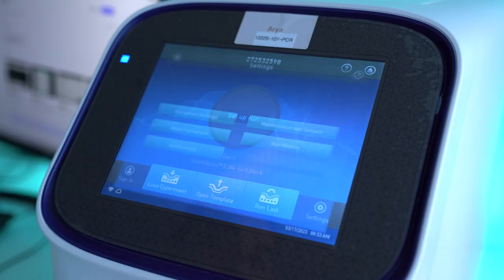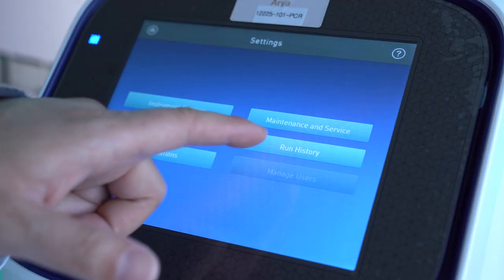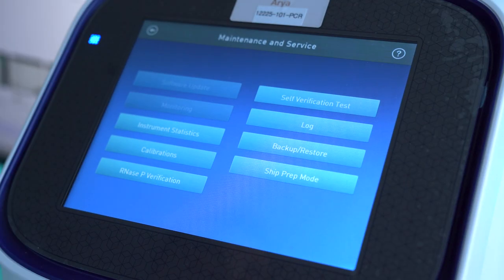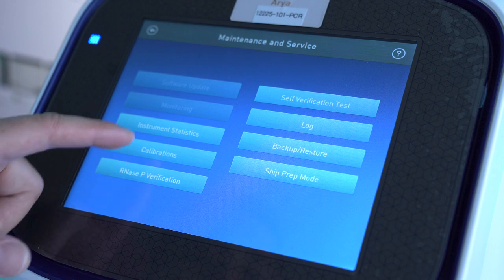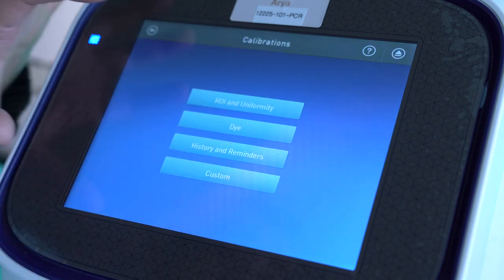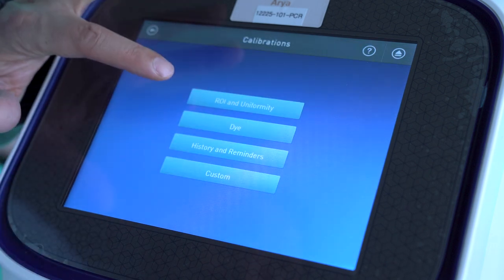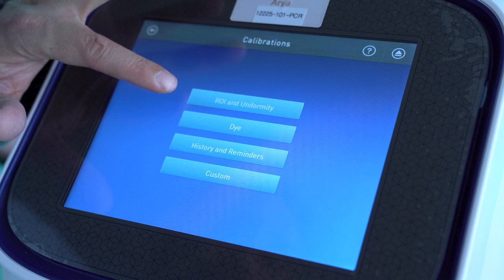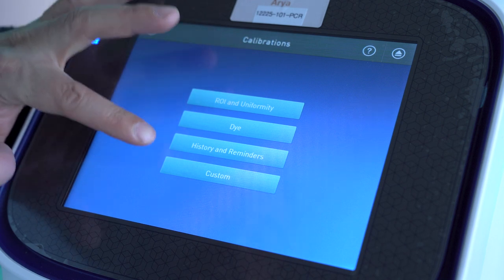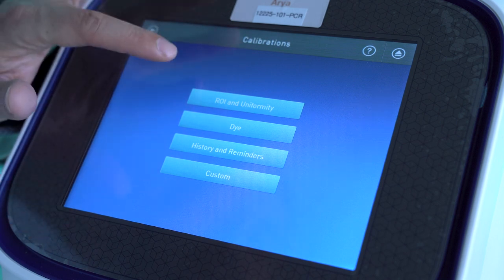So if you click on Settings, and you click on Maintenance and Service, and then you click on Calibrations. You'll see here where it says ROI and Uniformity, Dye, History, and Custom.